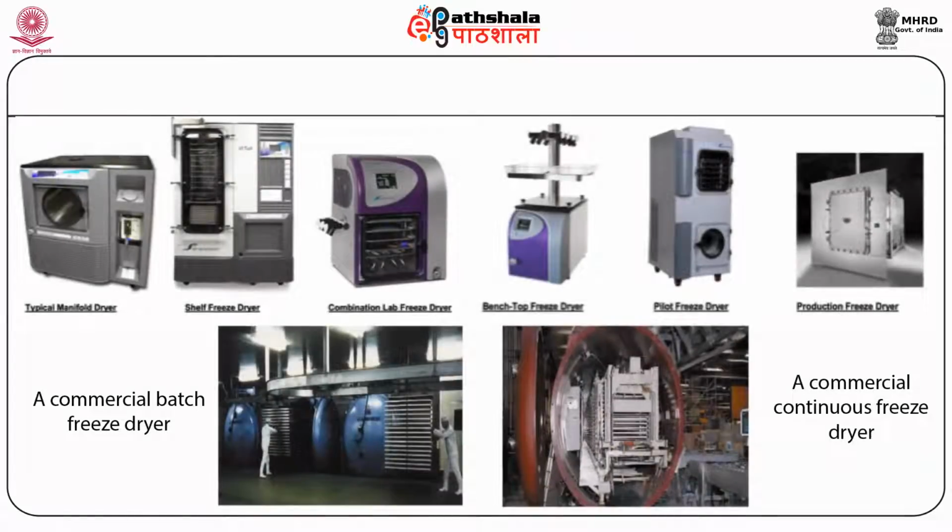Coming to the various types of freeze dryer as shown in this picture, there are mainly two types of freeze dryer. If you consider a commercial batch freeze dryer and commercial continuous freeze dryer, there are many more types, other types also available, which we can list as a typical manifold dryer, shelf freeze dryer, combination lab freeze dryer, benchtop freeze dryer, pilot freeze dryer, production freeze dryer. At the bottom, we can see one example, as I have told, is an example of commercial batch freeze dryer, and another on the right hand side, the example of commercial continuous freeze dryer.